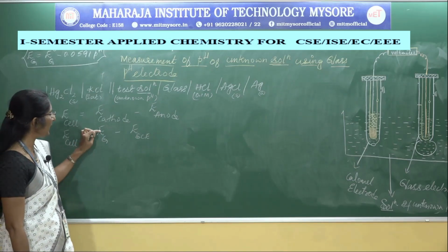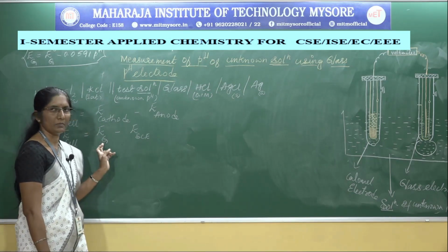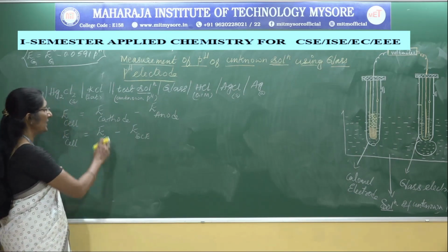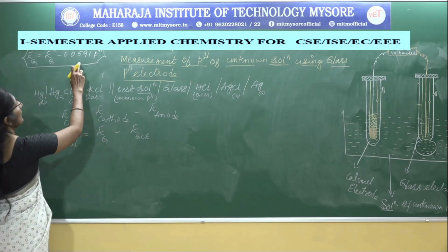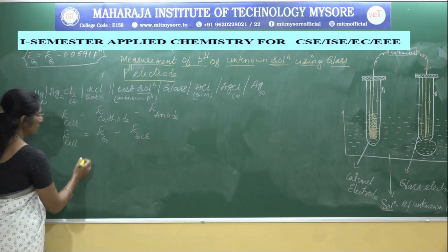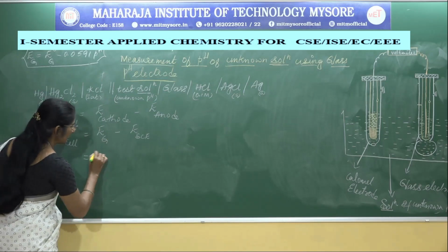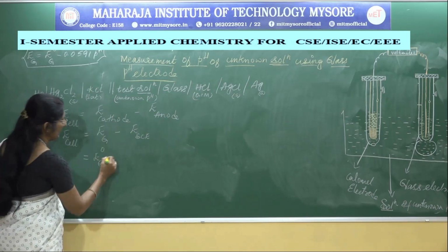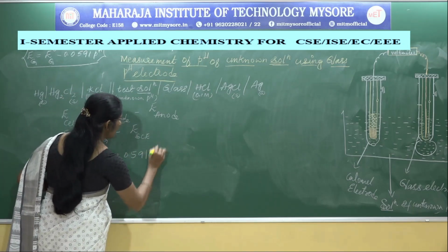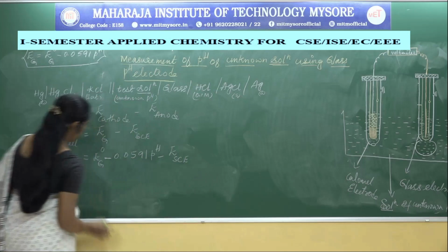We already know that the electrode potential of glass is the sum of the boundary potential, reference potential and the asymmetry potential, and simplifying this we get the expression Eg as Eg naught minus 0.0591 pH. Substitute that value here. What is the electrode potential of glass expression? It is E naught G minus 0.0591 pH, minus the electrode potential of saturated calomel electrode.